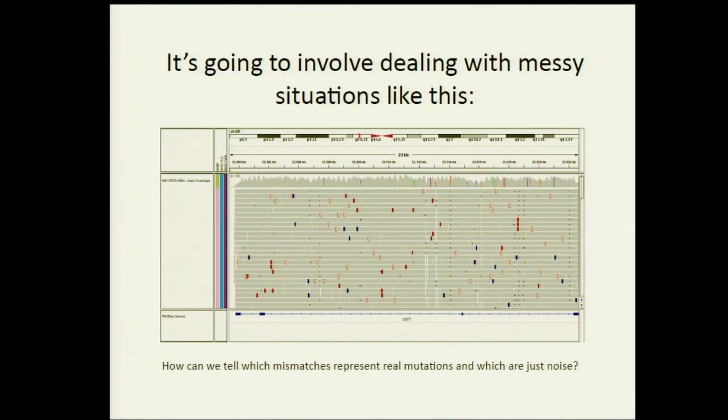It's because the data is not so easy to work with. You remember that first IGV screenshot we showed you, with that nice, beautiful SNP? Well, we had to doctor it a bit to make it look so nice. This is what a usual screenshot looks like. You see all these red and blue dots everywhere? Again, these are mismatches. It's kind of blown up. We step back a little bit so we can put it all on one screen. But how much of this is actually error? You see up here, there's a depth track, and there's a lot of color here.